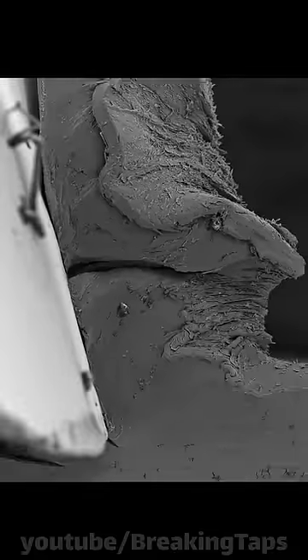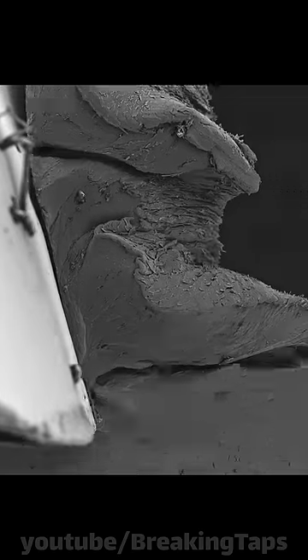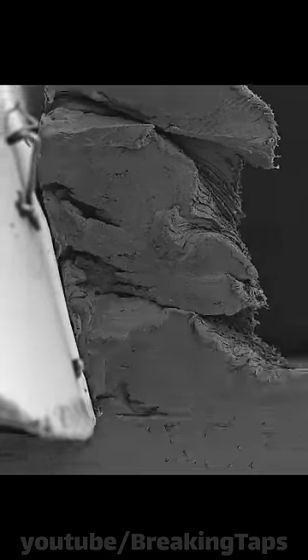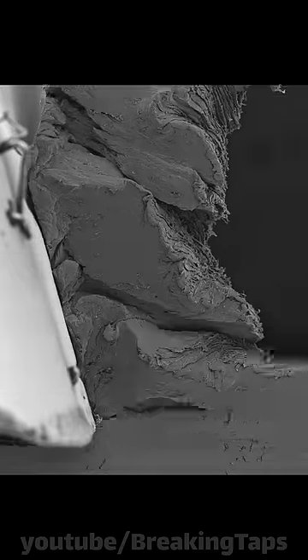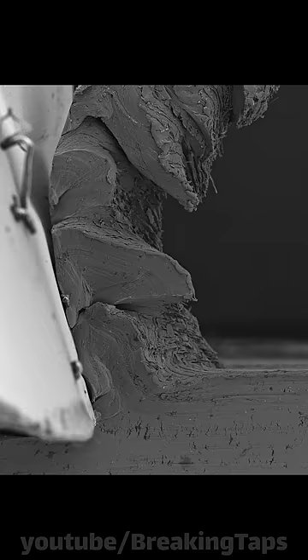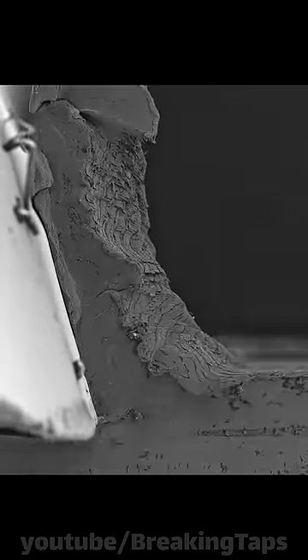This is a time-lapse of metal being cut inside of a scanning electron microscope. It's about 600 times magnification. The cutter, here, is made of tungsten carbide, a super hard material that can hold a very sharp edge. The metal is aluminum, which is pretty soft as far as metals are concerned.